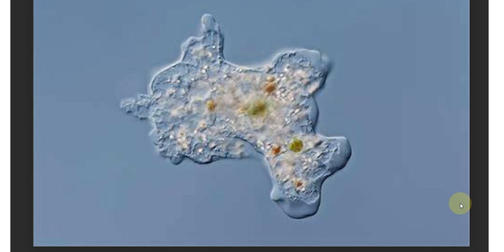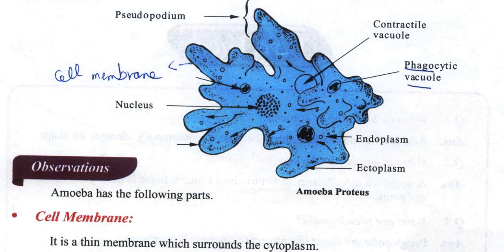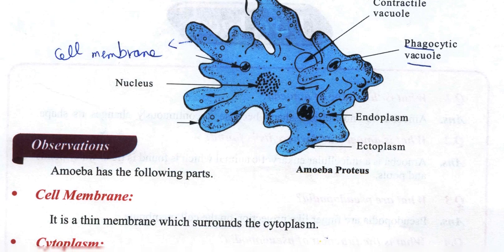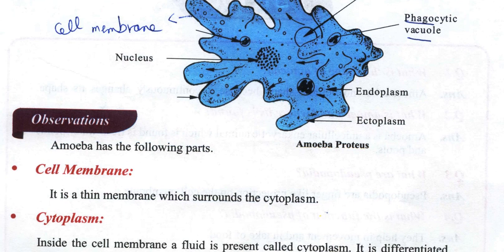Now you can observe amoeba. Here is the labelled diagram of amoeba along with its observations. These are the observations related to amoeba.